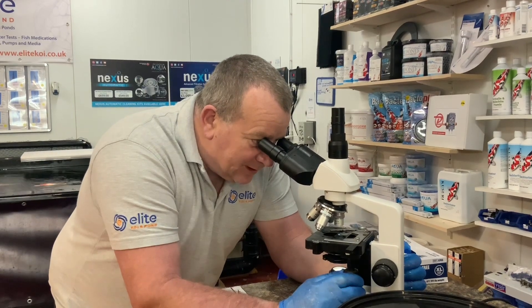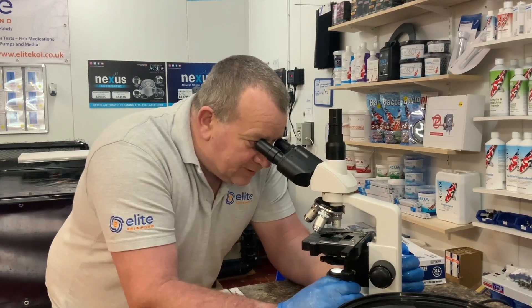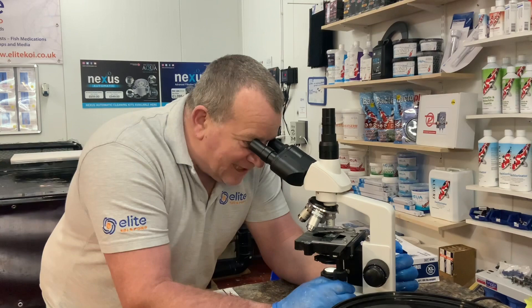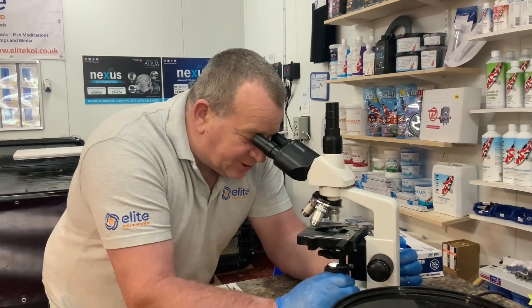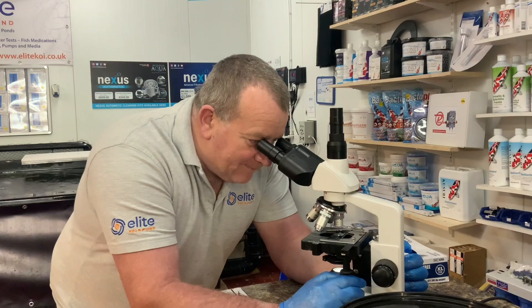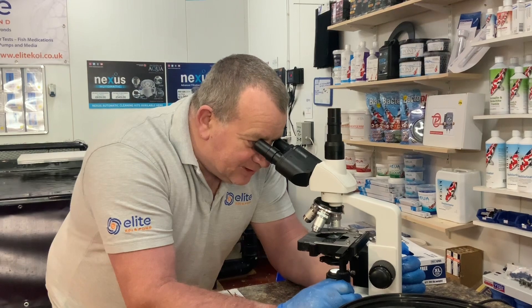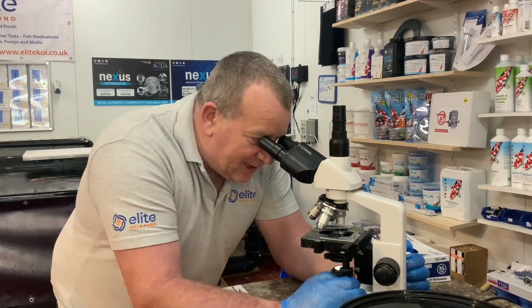So looking on the slide — the fish are clamped and they've been flashing. Just scanning across and looking in all the favourite spots. Firstly I'm looking for white spot, then trichodina, flukes — you'll spot them all at this magnification. Moving all the way across the slide — I can see parasites there. We've taken a small sample from three koi and we have two flukes.